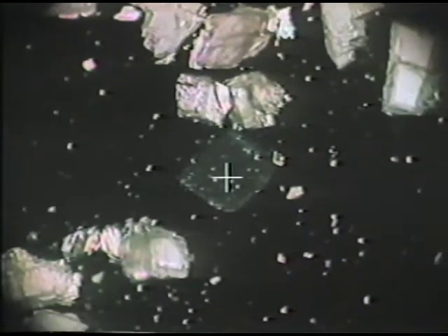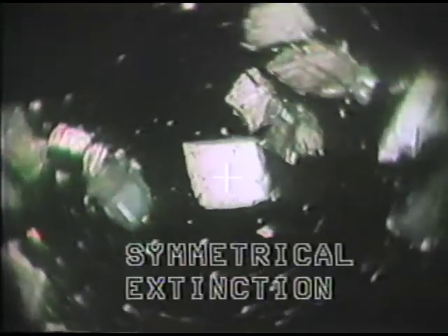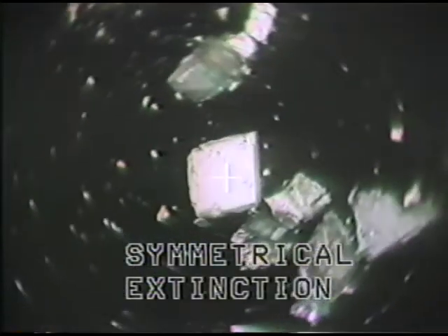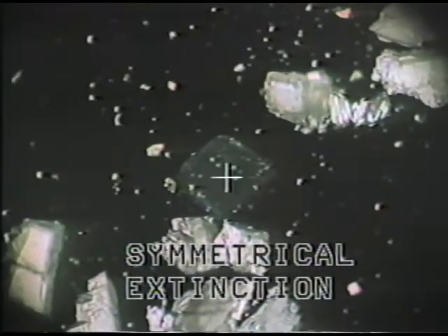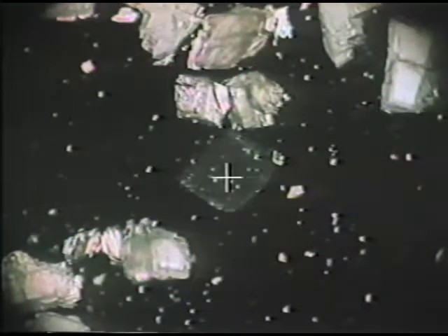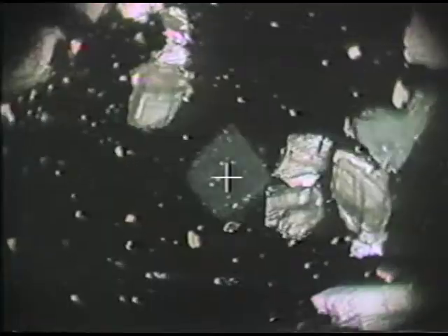This kind of extinction is called symmetrical extinction. And calcite, and indeed many minerals which have prismatic cleavage, show symmetrical kinds of extinction. So symmetrical extinction is a property which you should be able to recognize readily again in orthoscopic view looking at cross polars.